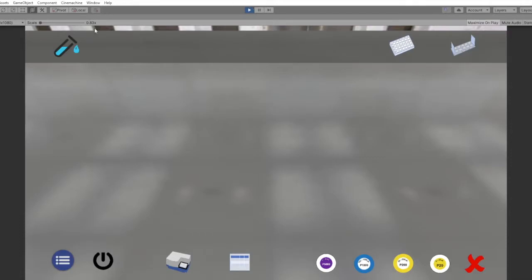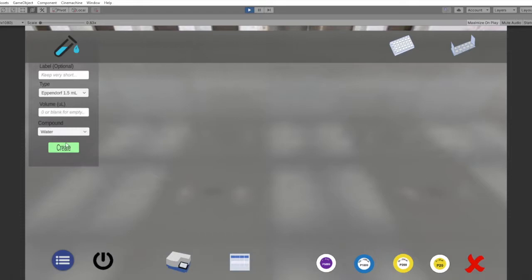Okay, so this data generator and simulator gives you practice at particular techniques. You can generate lots of data. You can create tubes, as you can see, just a blank tube there, a little blank Eppendorf tube. If I type a volume in, I'll get something in it, in this case water, and maybe if I do that again for the standard solution, which is a blue solution, we'll get some of that. Of course, it's a good idea to close the lids when you do these.